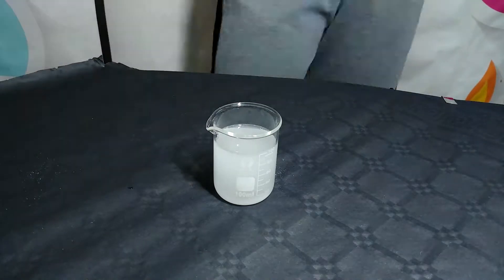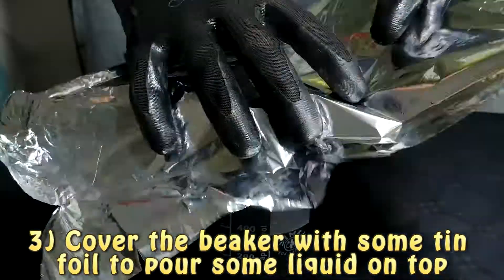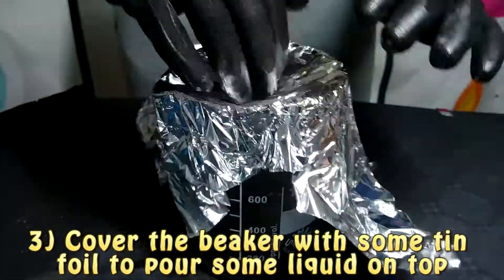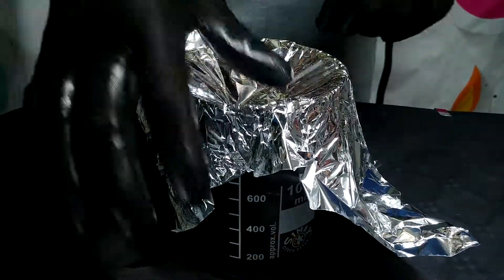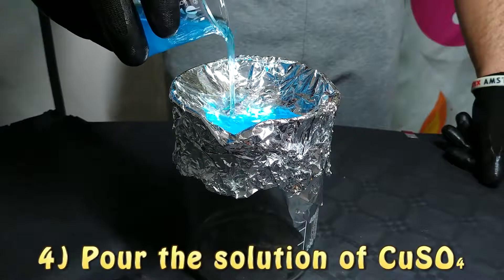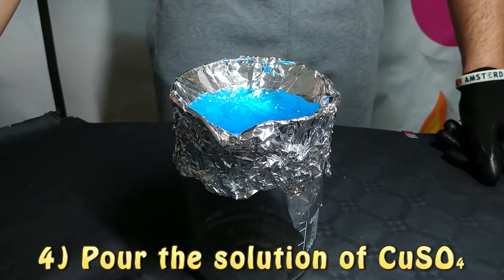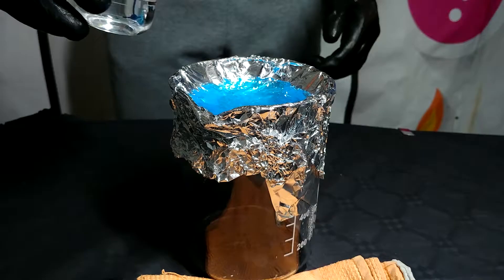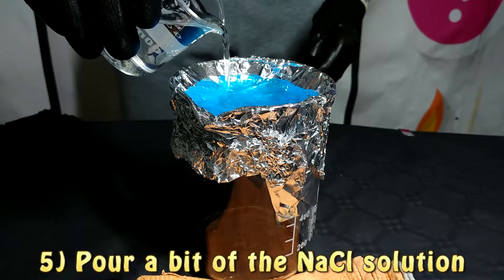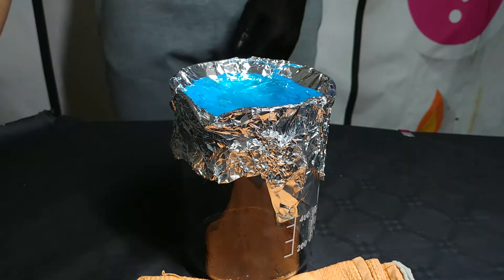First we are going to prepare a concentrated solution of copper sulfate, because the copper is contained in this solution. Then we are going to prepare a solution of sodium chloride, or common table salt, which doesn't have to be very concentrated. After that, we are going to place some tin foil on a beaker, pour our solution into the cup formed by the aluminium foil, and then the reaction will start and you will see copper metal forming.